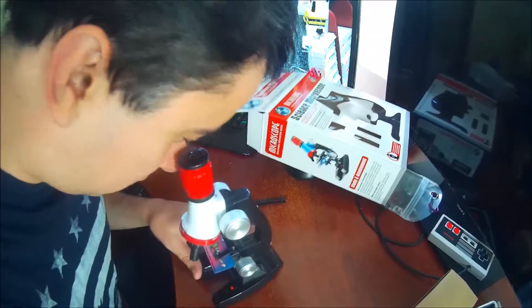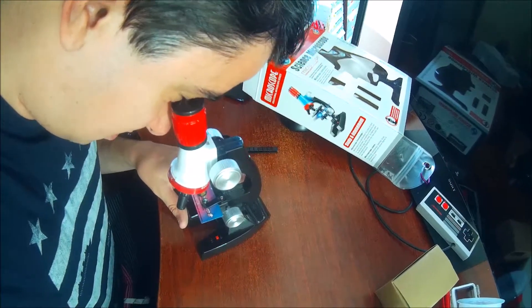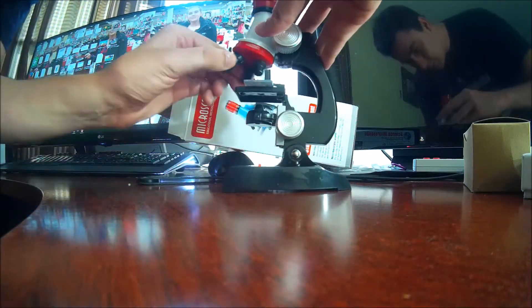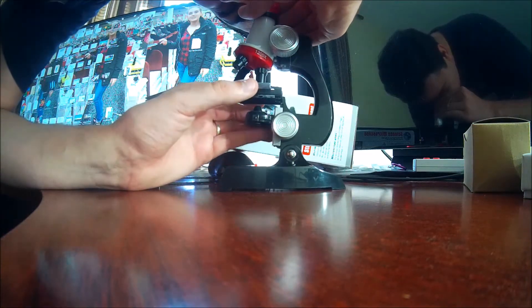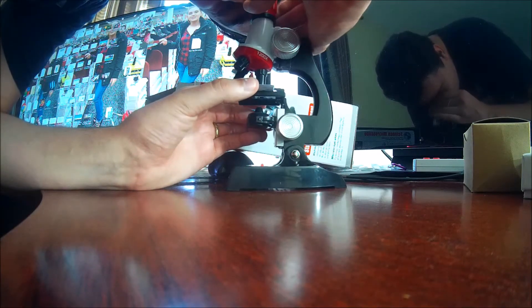Alright guys, we're going in for the 1,200 zoom. Oh my God, that's incredible. I can't believe what I'm seeing here. I'll adjust this a little bit and turn down the zoom to 400x and adjust the specimen. Wow, this is a cool microscope, guys.